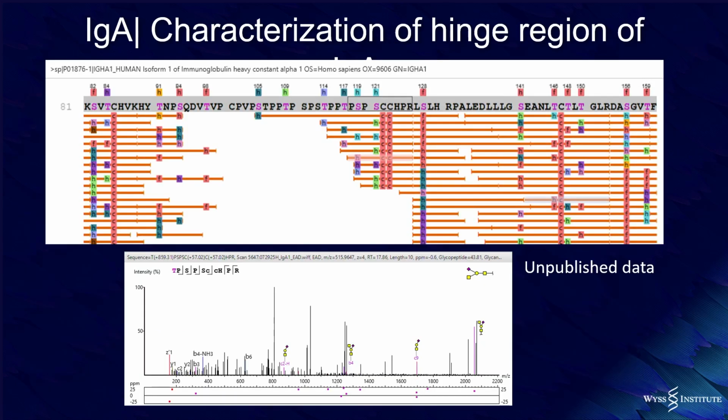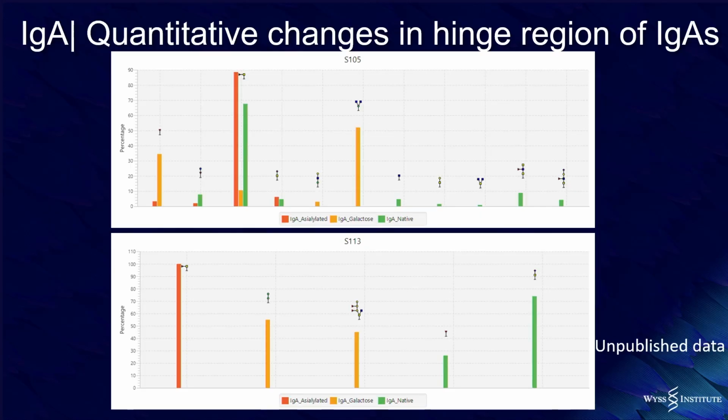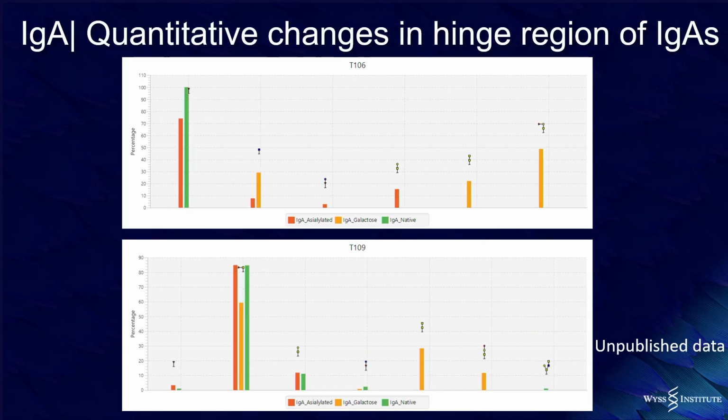That's where the importance was, just to make sure we see this particular peptide that comes from the lysine digestion, to make sure we understand what that sugar pattern is on that particular region. Again, even on that region, we can have a comparison of what is changing, what is not, from the native to the peanut butter allergy process, and how we can address this towards a possible treatment.